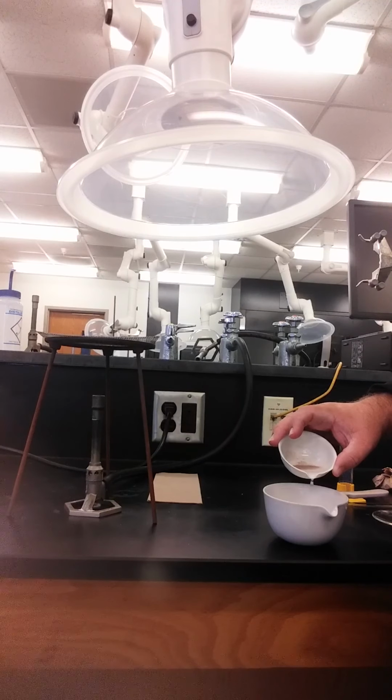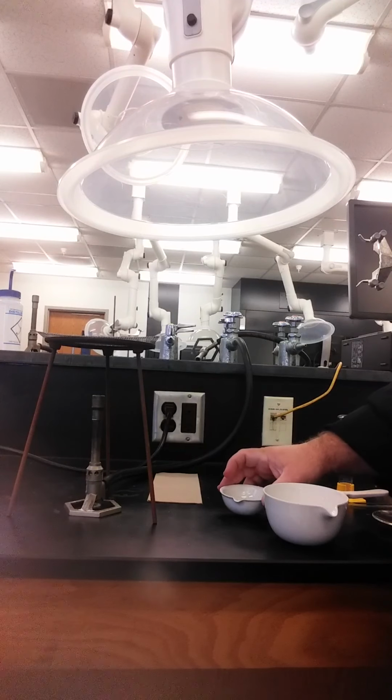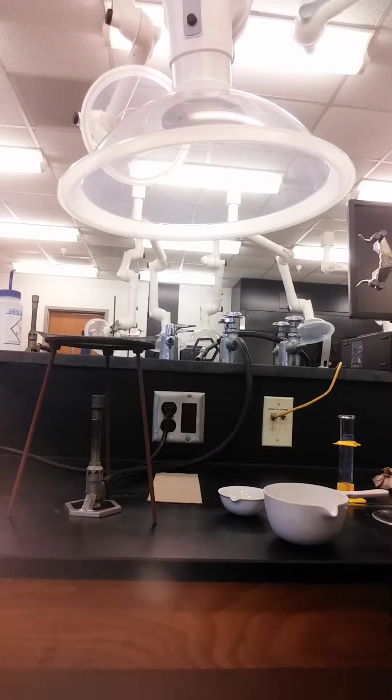We must take our time and be very careful not to contaminate the large dish with the silicon dioxide. You will repeat this process with 2 additional 10 milliliter volumes of water. This will ensure that all the sodium chloride has been extracted from the silicon dioxide.